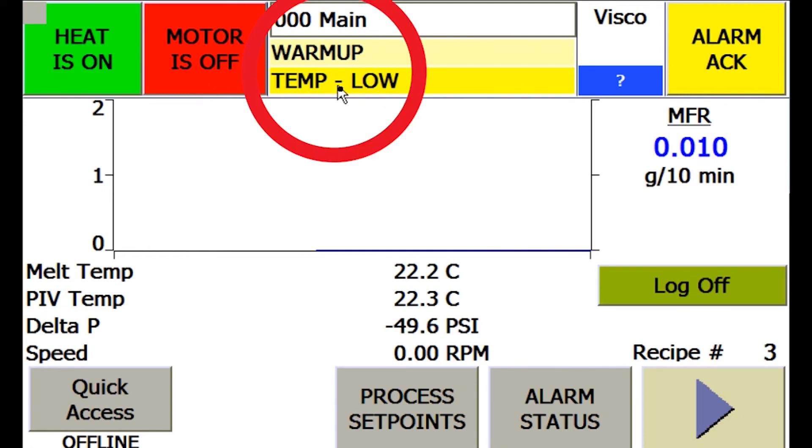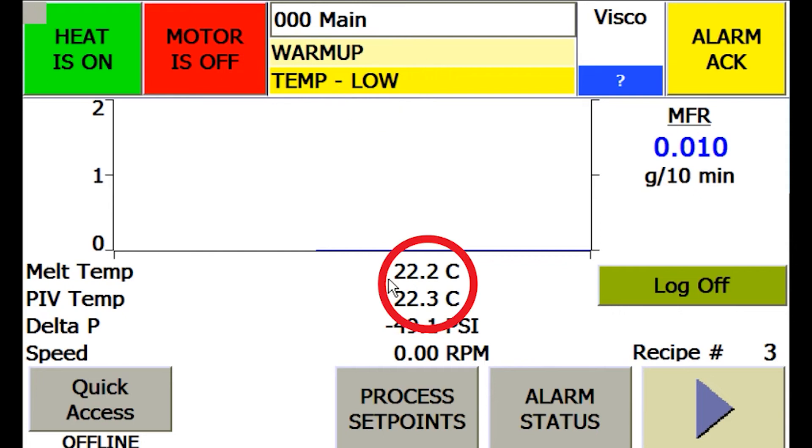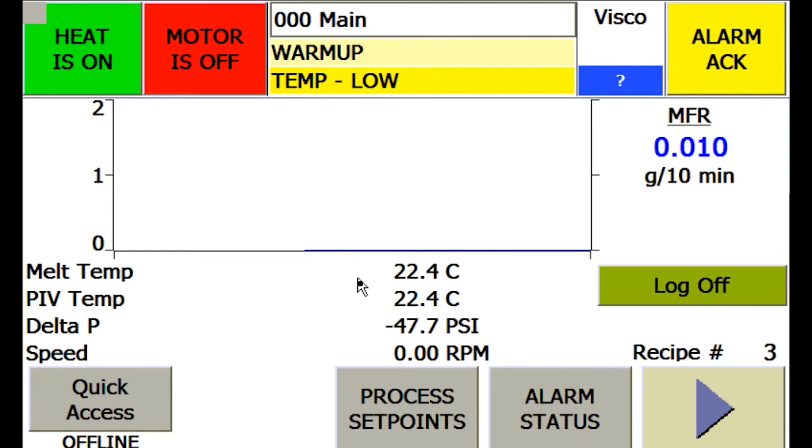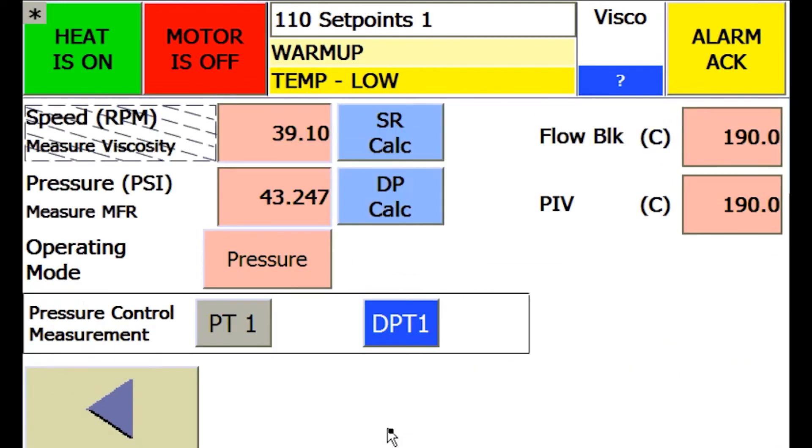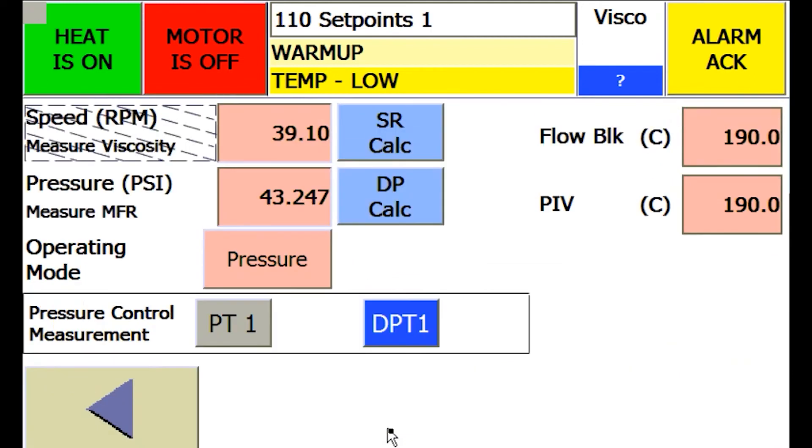Currently, the system has to heat up fully to get to that point. To set the running conditions of the system, select the process set points button. These are the main parameters for the overall system such as zone temperatures, speed and pressure settings, and which mode of control you wish to use.